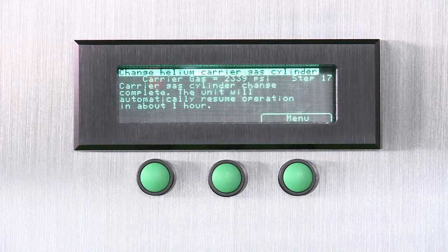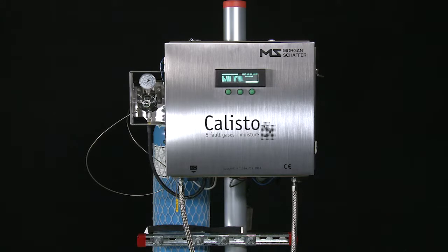Carrier gas cylinder change complete. The unit will automatically resume operation in about one hour.